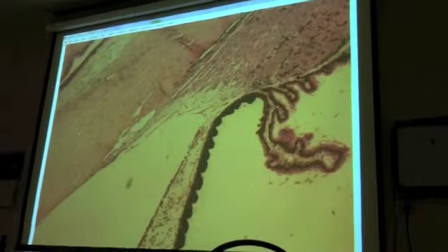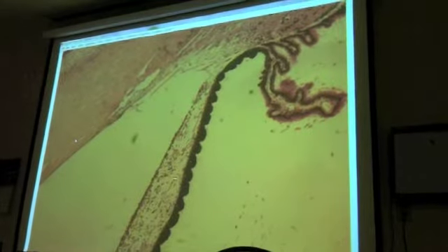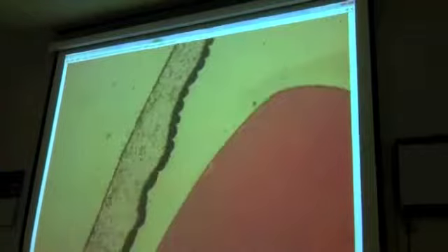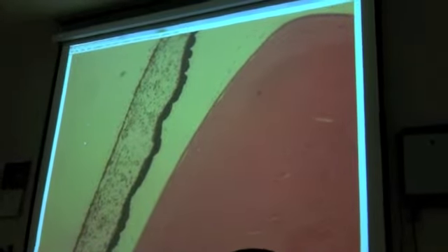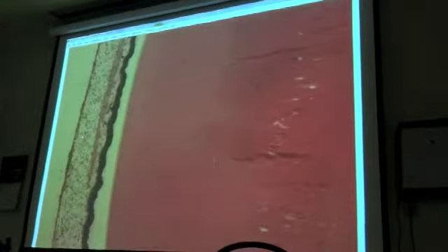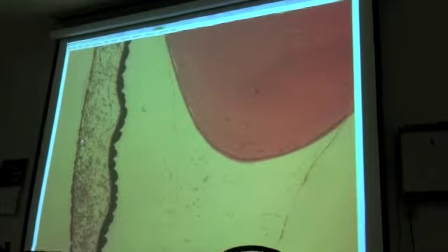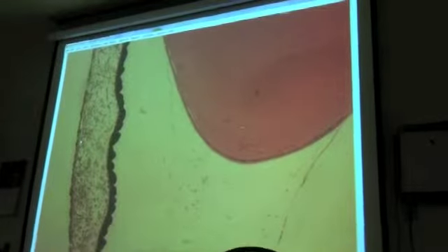So we're just on the edge. Show me that part of the iris. So this is iris, and now watch it as I move it. It's going in front of the lens, and we keep going. So we miss the pupil. The section is too far to the side of the pupil.